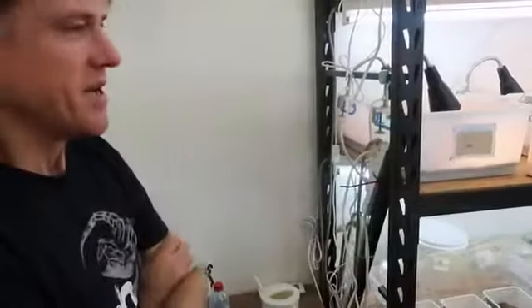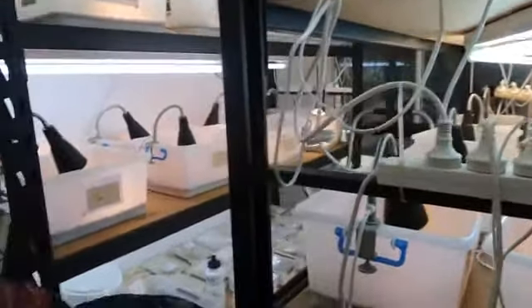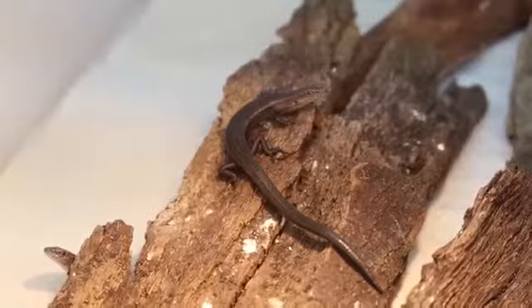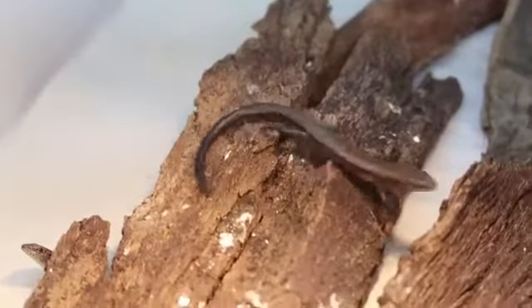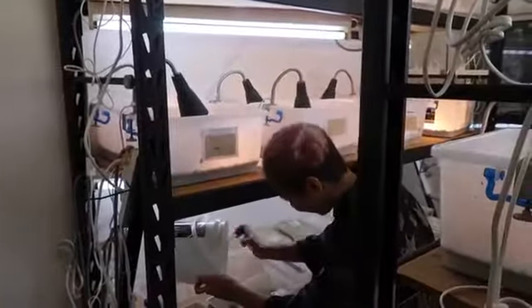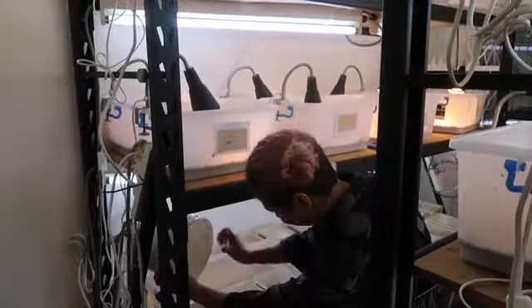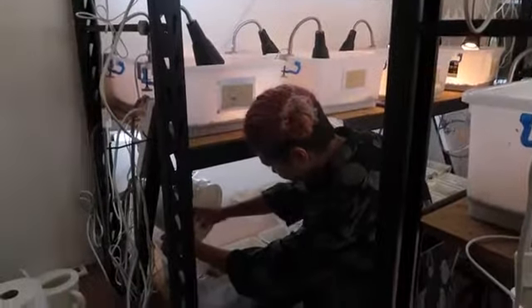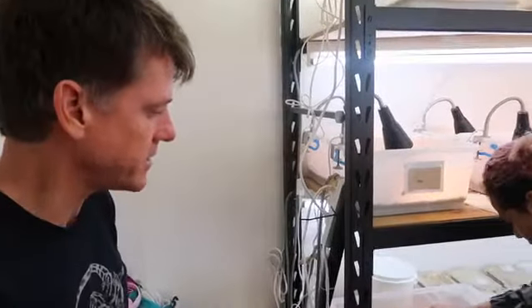So this is one of our lizard rooms. We've got two small buildings, and this is more like a complex of rooms, and we've got a whole lot of Lampropholis in here, which are the small delicate skinks that are very common around Sydney, and Christine is in charge of maintaining the colony, you could say, and she's busy feeding a whole bunch of baby skinks baby crickets, because these are particularly small skinks, so we have to special order these tiny crickets that they can eat.